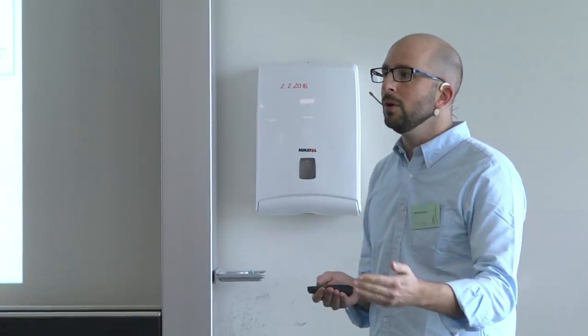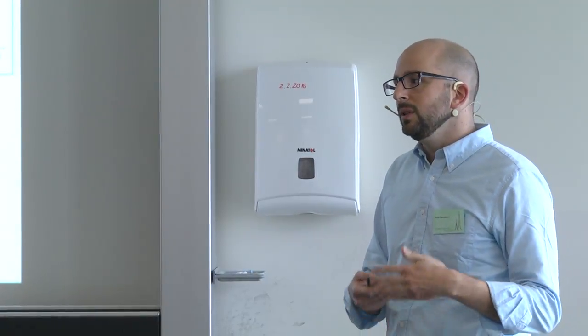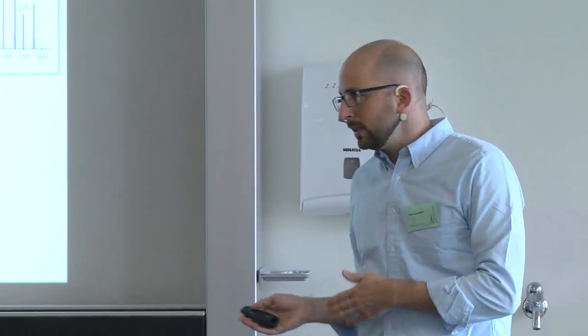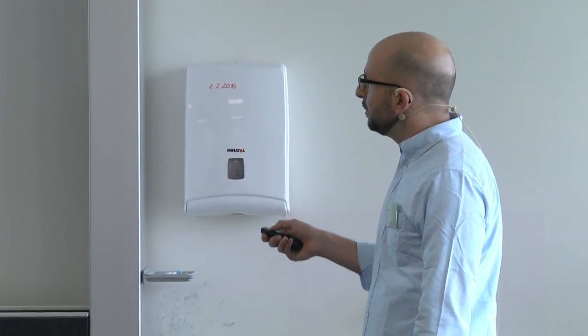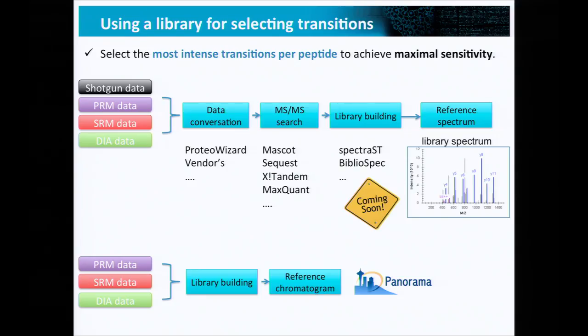So that when you go to your home laboratories and you want to build your own libraries, not always they're available or downloadable, then you would need to build from your own data, and you would basically be following something similar to tutorial 3 in order to be able to do it yourself. And the last thing I want to mention: we will hear much more about library building, especially because this has a lot of implications when we do DIA. So we'll hear a talk where we will talk more about how to build libraries.